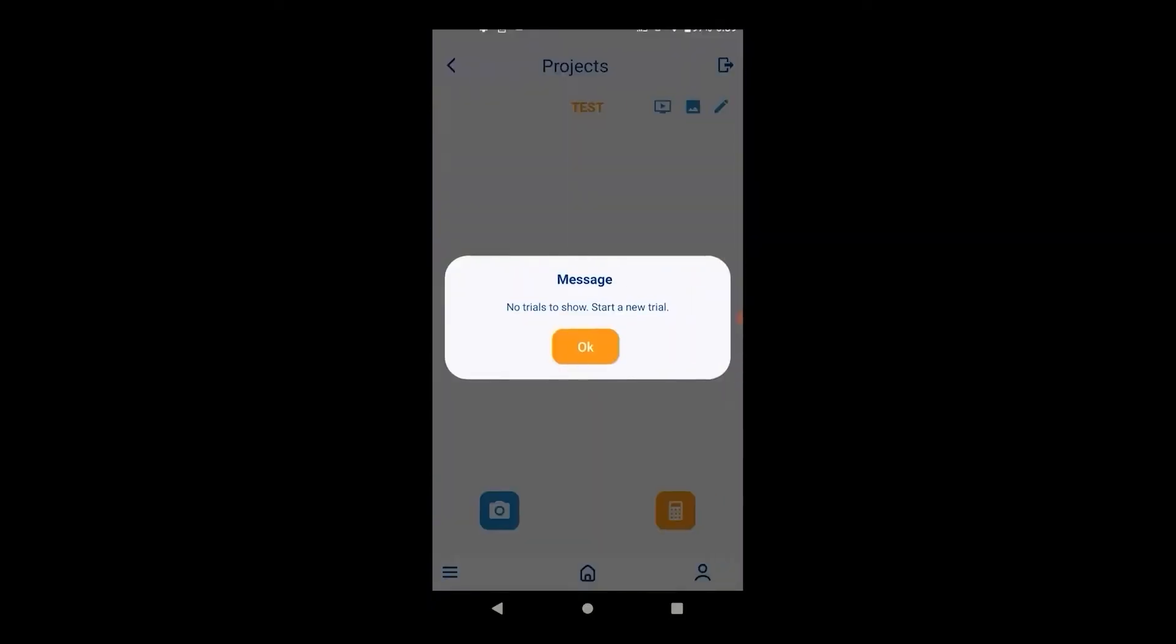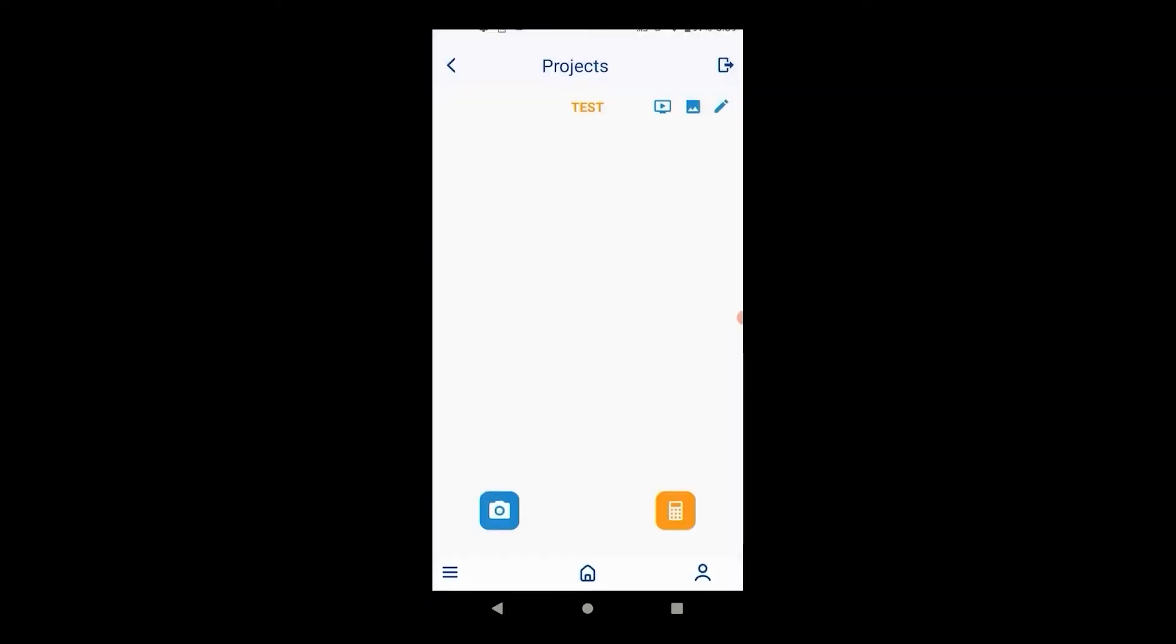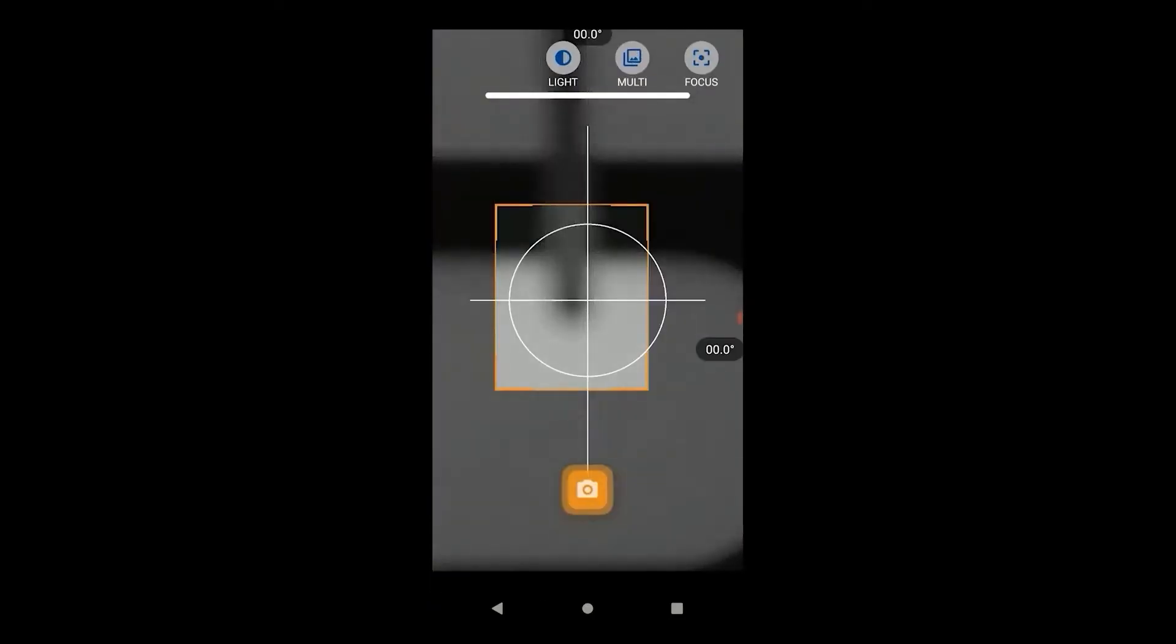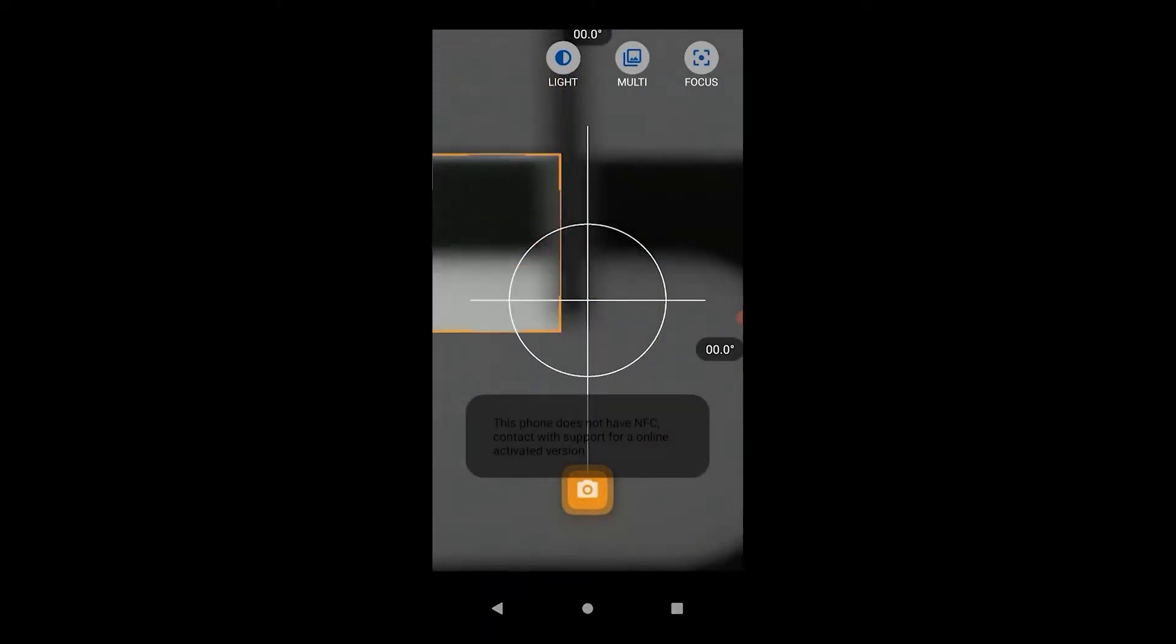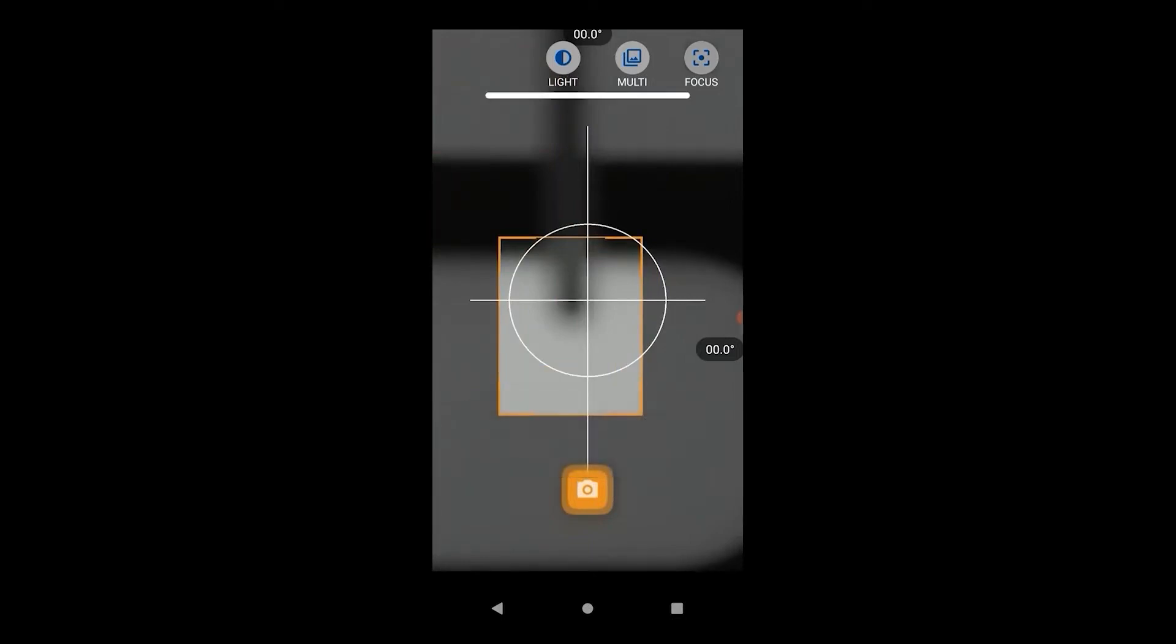Now put the phone inside the phone holder. Click on the blue image capture button and adjust the distance from the needle. We manipulate the orange box to select the area of interest before adjusting the focus on the image.